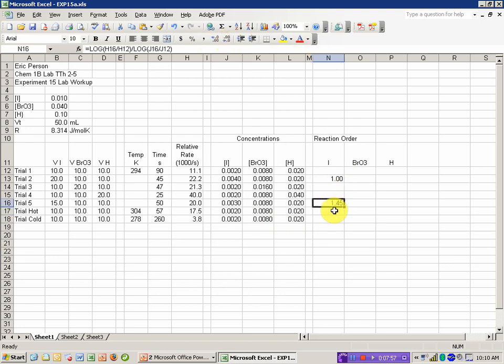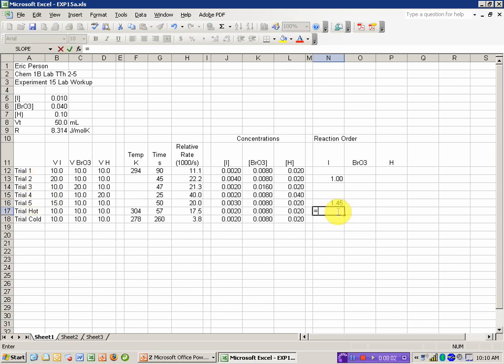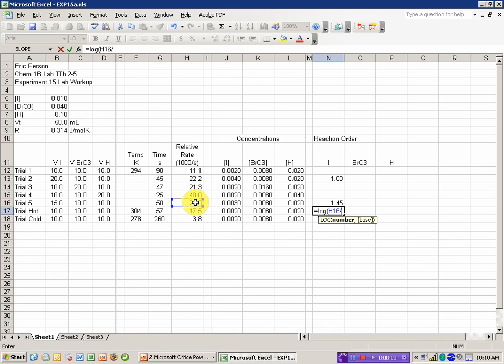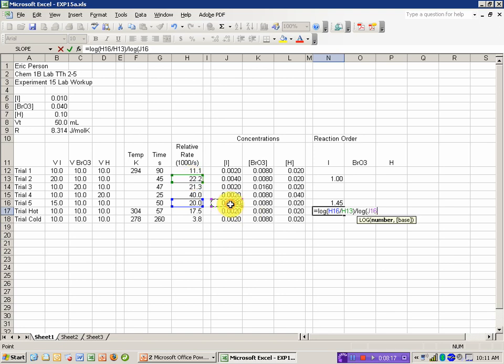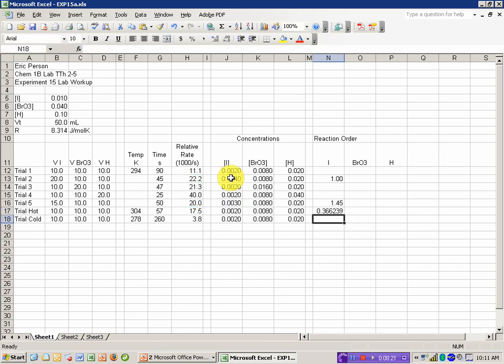I'm going to reduce the number of sig figs so it's easier to read there. I have another one. I can compare 5 to 2. I'm going to go ahead and stick that in this cell here. And I can take the rate of trial 5 divided by the rate of trial 2 divided by the log of the concentration in trial 5 by trial 2.